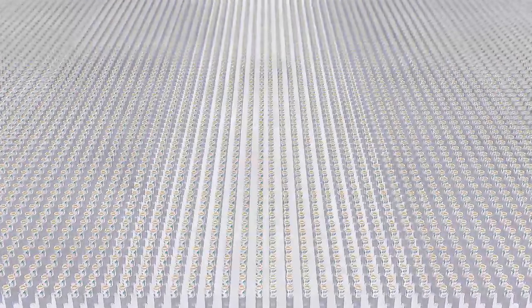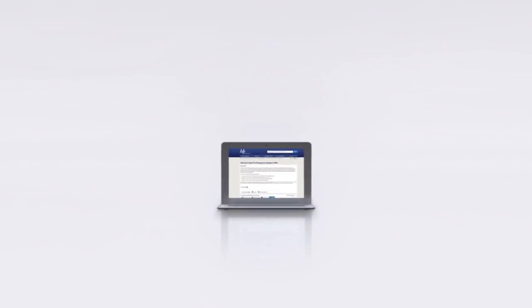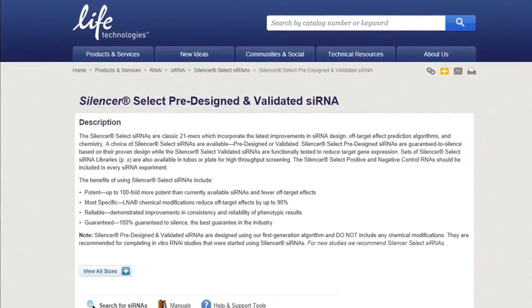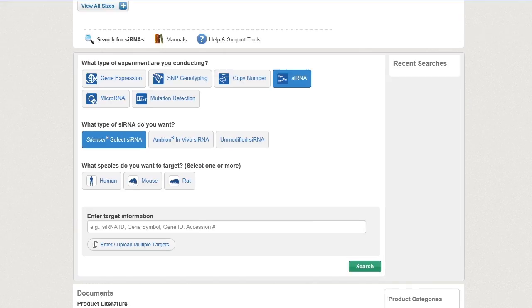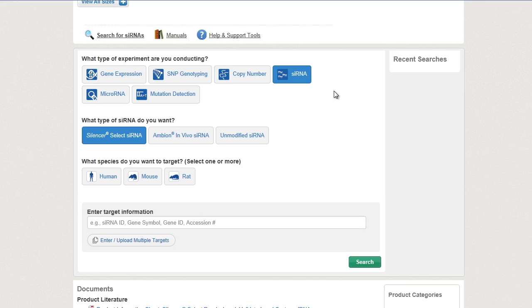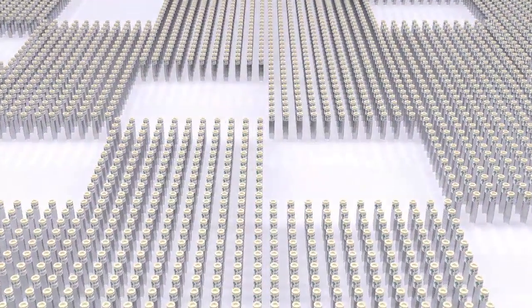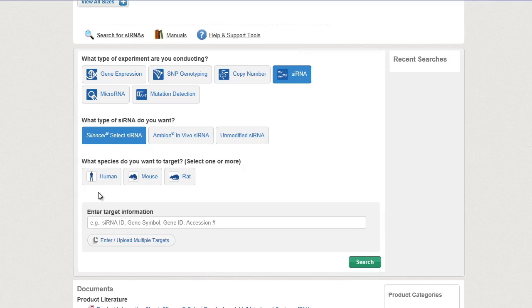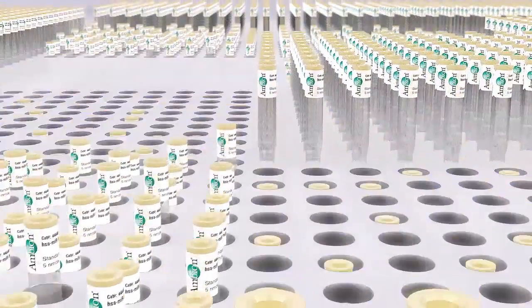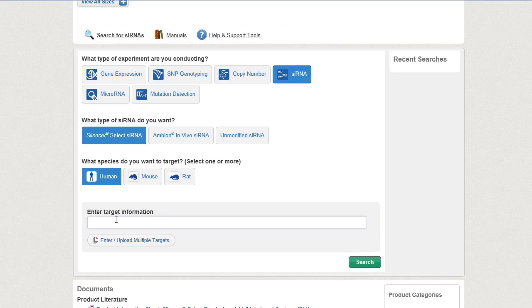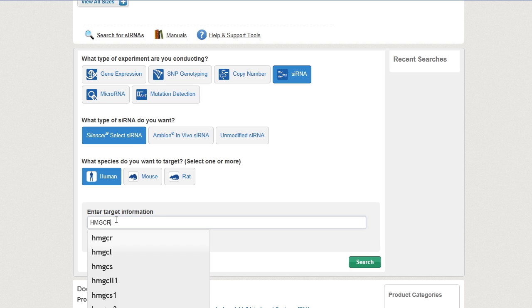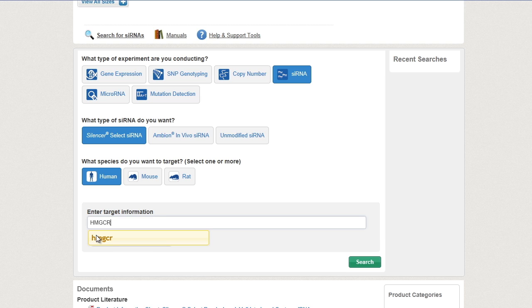It's never been easier to search the more than 200,000 siRNAs with the new genomic search tool from Life Technologies. Starting your search is a snap. Select your experiment, an siRNA type, and choose from the three different species found in the RefSeq database. Enter your target information, and the tool will automatically display search suggestions.